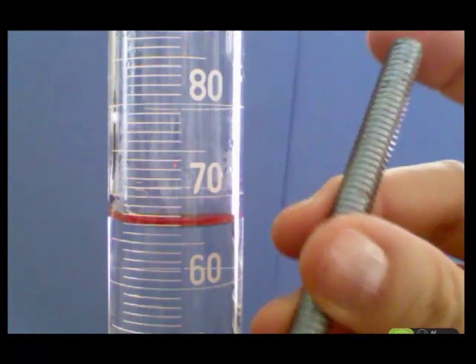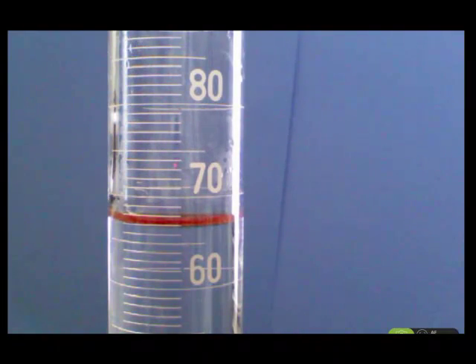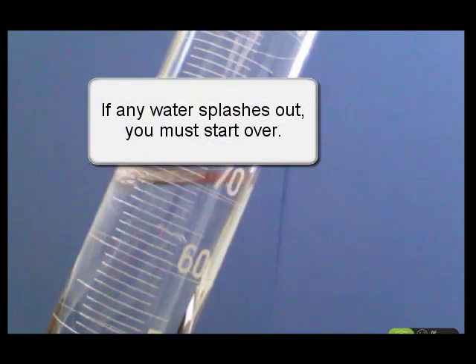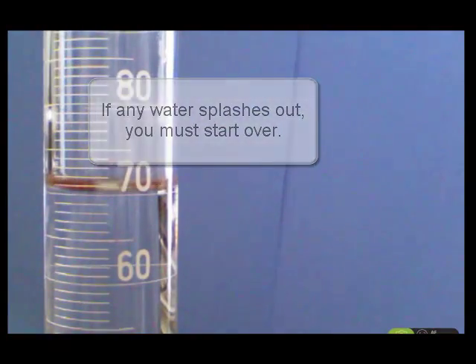And then what I'm going to do is carefully slide my bolt into the water. Now you want to do this carefully because this is glass, and you certainly don't want to break the glass. I'm going to tilt it a little bit. Okay, and kind of shake some of the air bubbles out of there.